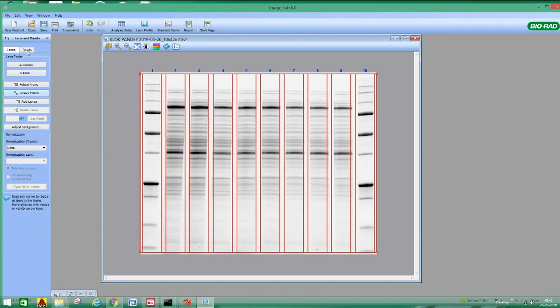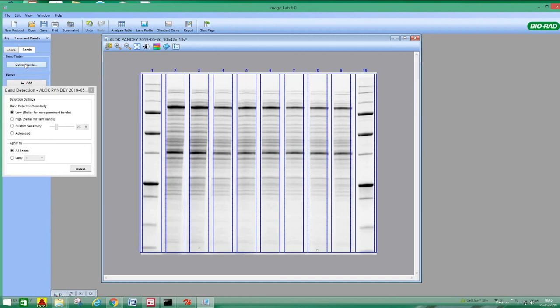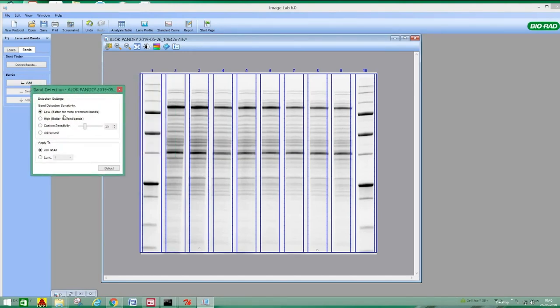Next, after identifying the lanes, you have to go to bands. How many bands are there? So you allow the software to detect the bands. Here a few options are there. Band detection sensitivity, one is low. Low means better for the most prominent ones. If you keep it at low sensitivity, then it will detect only prominent bands which the software can observe based on intensity.